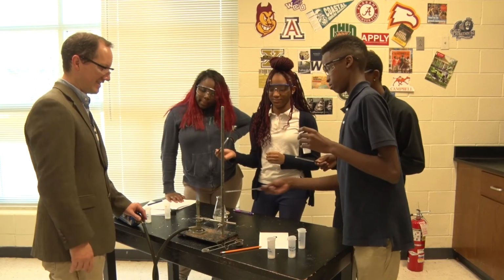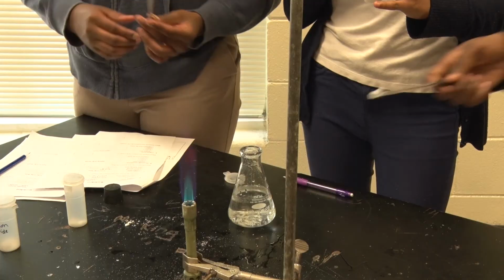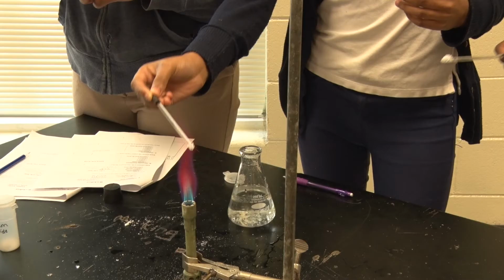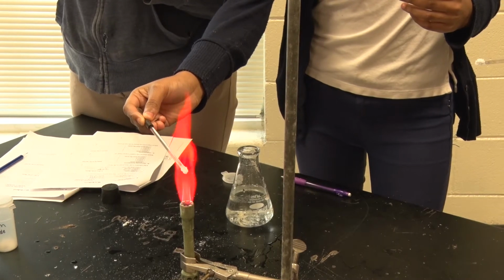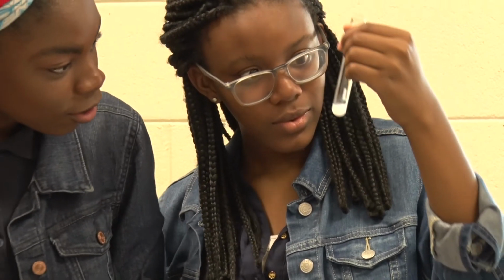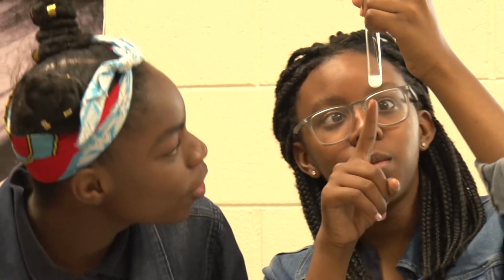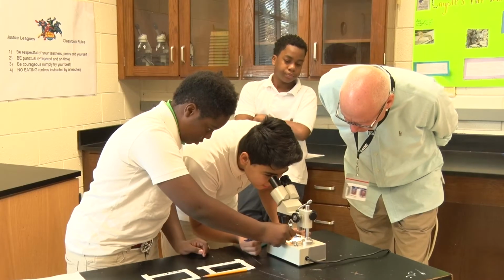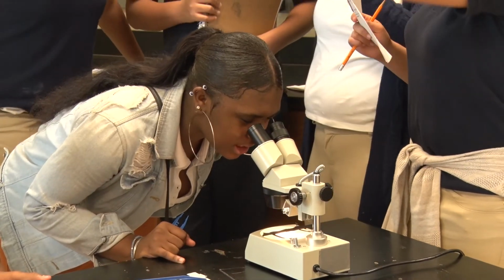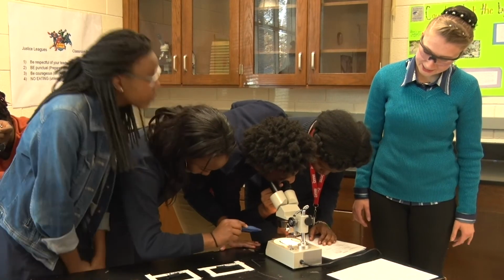The next center, the students analyzed flame tests with some of the elements they've already learned about and saw how they can determine the crime scene from the elements. Then they also looked at solubility with different powders. Then the last crime scene center was where the students were looking at the microscope and the different fibers that they found at the original crime scene.